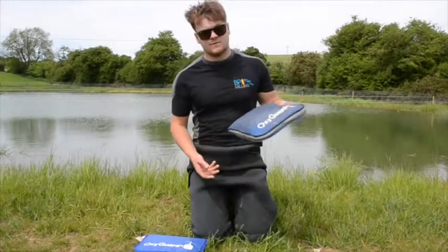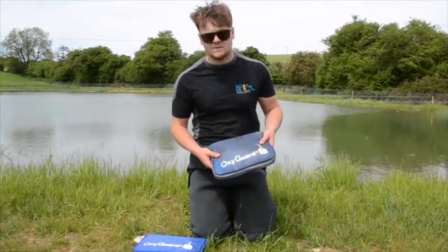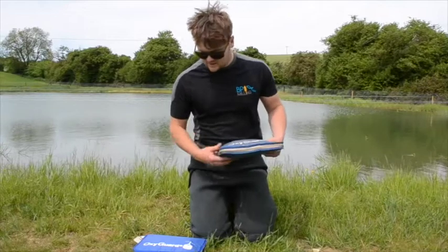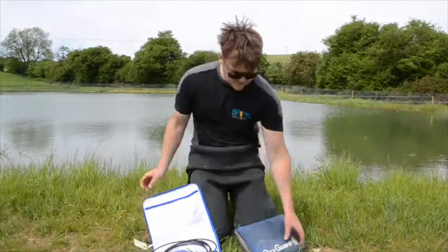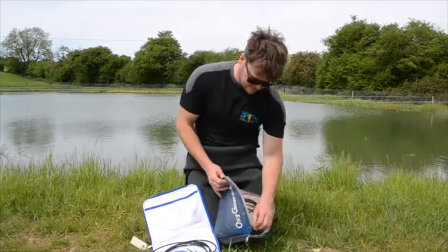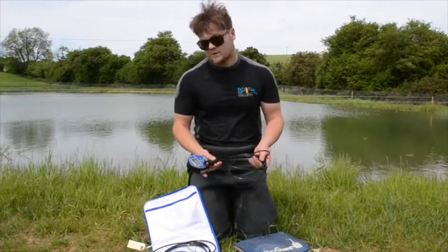My oxygen meter - I've had this probably four or five years. I've not had to calibrate it, I've not had to change a battery, and I've used it every single day this time of year. A really reliable piece of kit. You can probably tell the difference between mine and a new one - mine's a hell of a mess but it gets used and abused and it still takes an accurate reading.